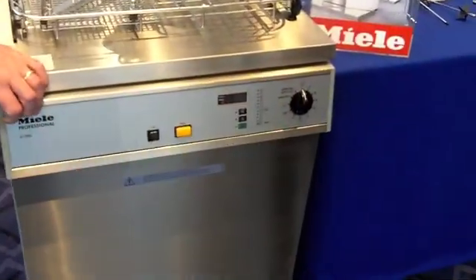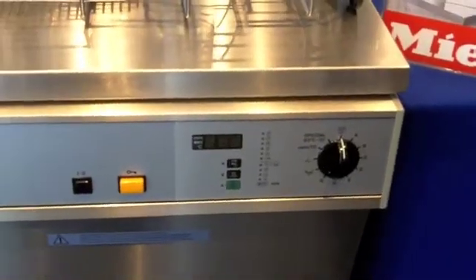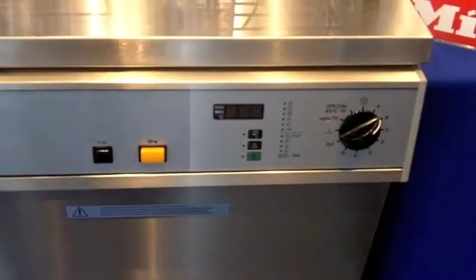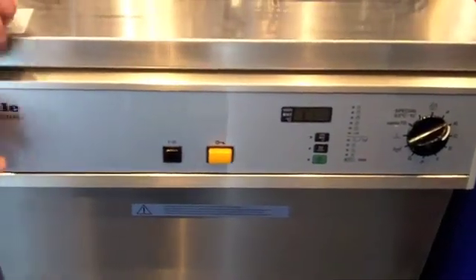There are your programs around the outside of the machine; it's quite easy for the user to use. It just selects the program and presses the green button and opens the door when it's finished.